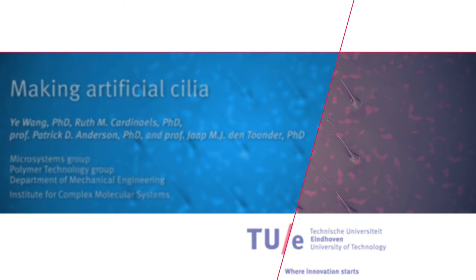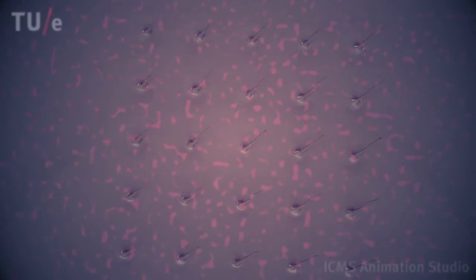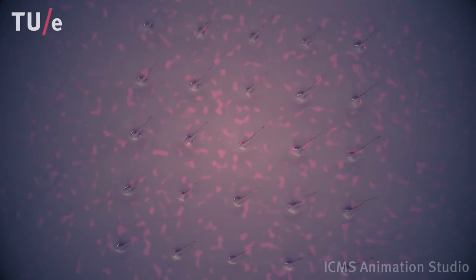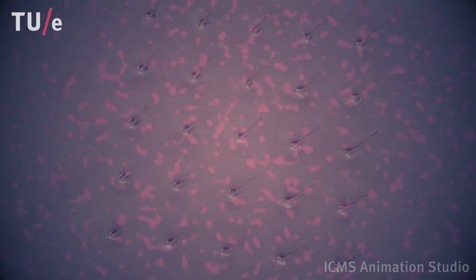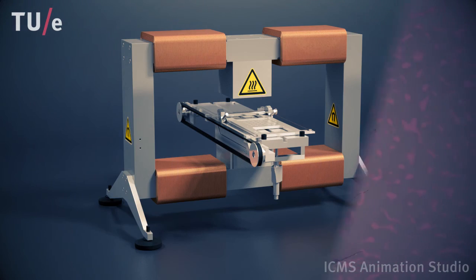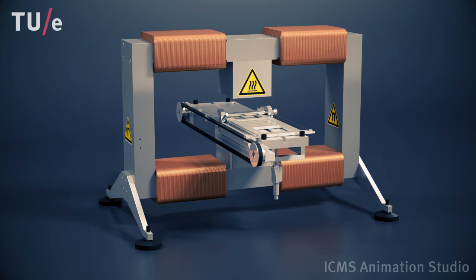Artificial cilia are bio-inspired micro-actuators that can be used to generate liquid flow in microfluidic devices. We have developed a special fabrication technique to make artificial cilia in a cost-effective manner.